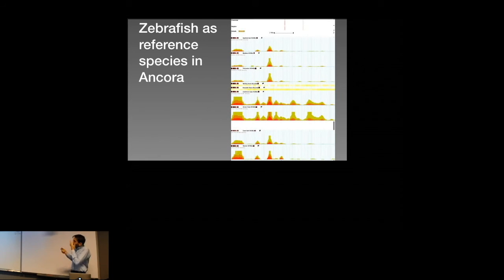Of course, since there are so many of them, these kind of stadium-like plots that you showed are going to be very useful for zooming out and showing things that are missing in different lineages. I think there isn't a big challenge here. These are all in standard formats.